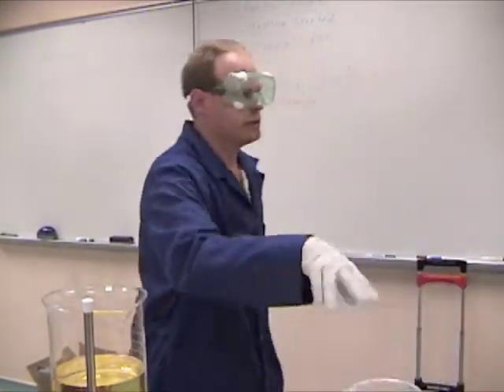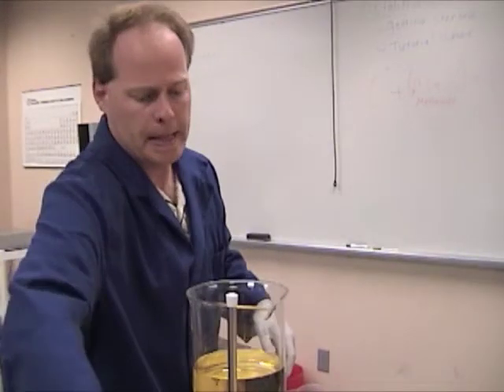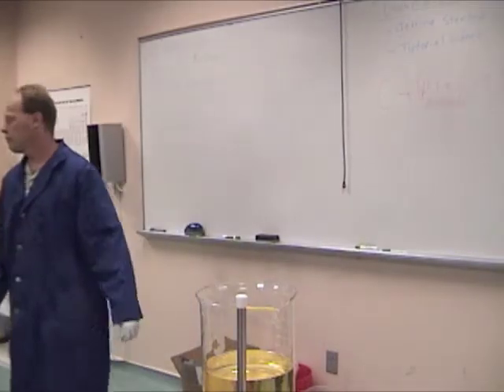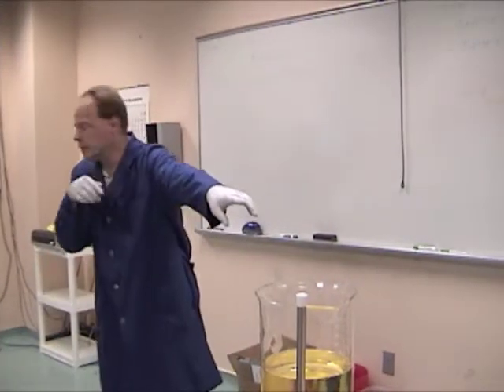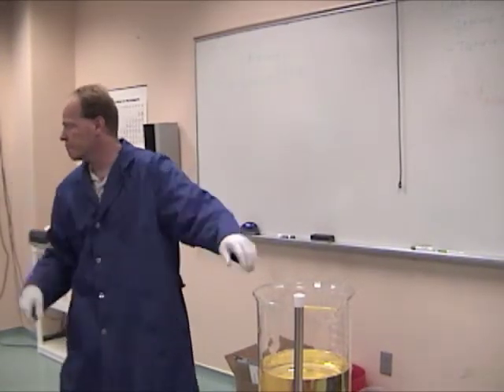Can you mix this? Or just turn that. I'm going to use chemistry up here. You had no reaction because it's pretty cool. Oh, it's reacting. No, maybe it wasn't. If it was warm, it would boil. Yeah. And actually, if we're doing this a little bit quick to get it dissolved, but if I was to let it sit here, you'd actually see it bubble up from the bottom.